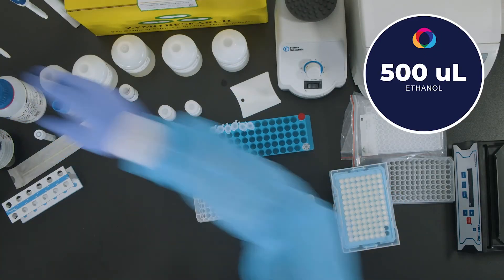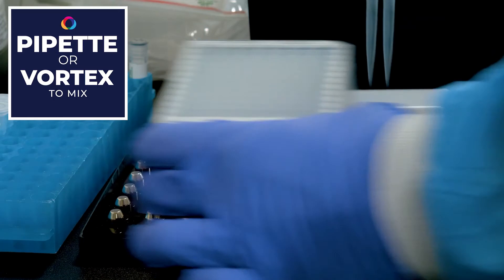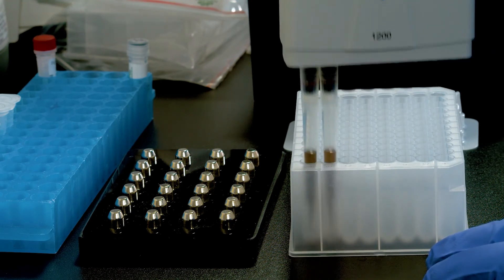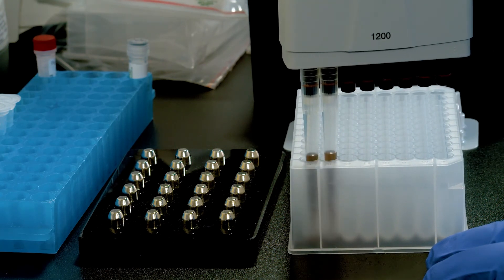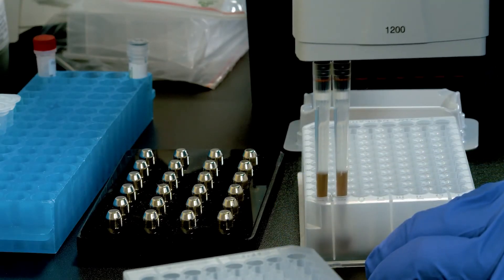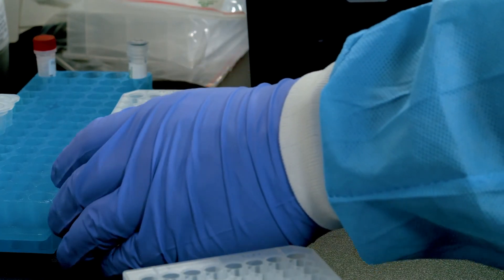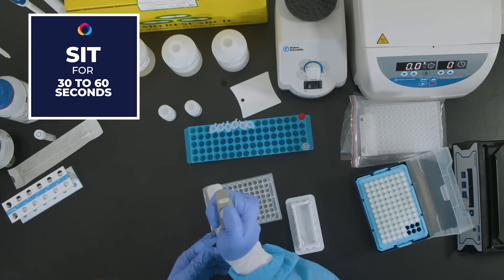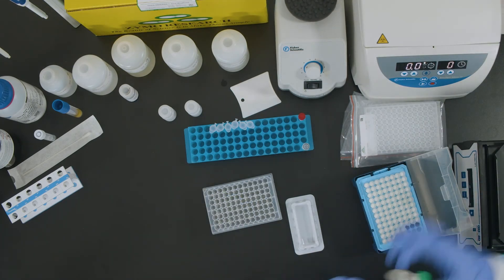Perform a second ethanol wash by adding 500 microliters of ethanol and pipette up and down to mix in plates or vortex to mix in tubes. Transfer the entire solution — both the beads and the liquid — to a new plate. Place on the magnetic stand and allow beads to pellet for approximately 30 to 60 seconds. Aspirate and discard the supernatant, removing as much ethanol as possible without disturbing the beads. This will shorten the amount of time the beads will need to dry.